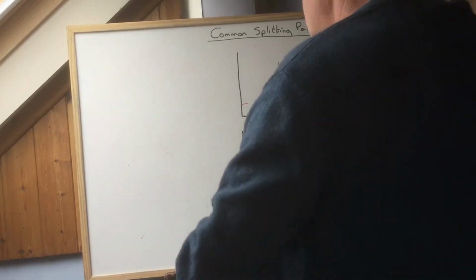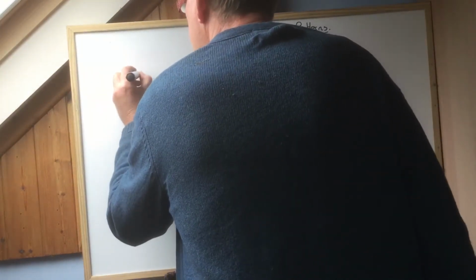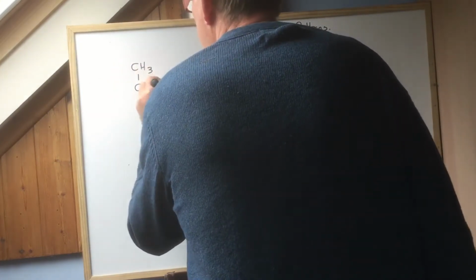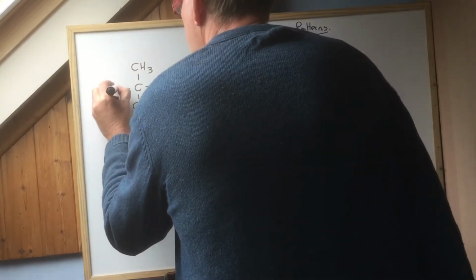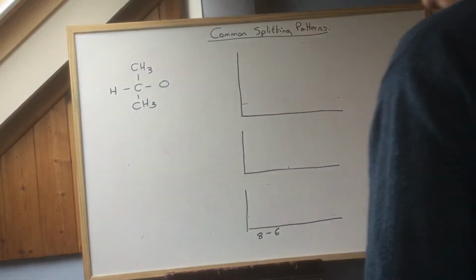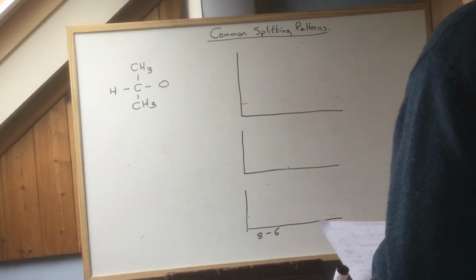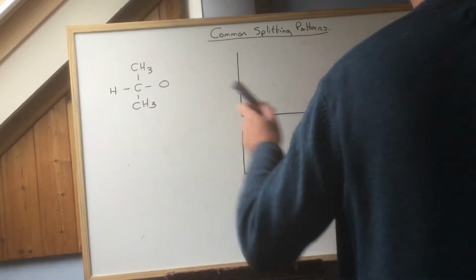Right, another common sequence might be this. CH3, again possibly joined in some kind of ester. H, you should be able to deduce that, no problem. Okay, let's see whether we can do it a bit fancy.